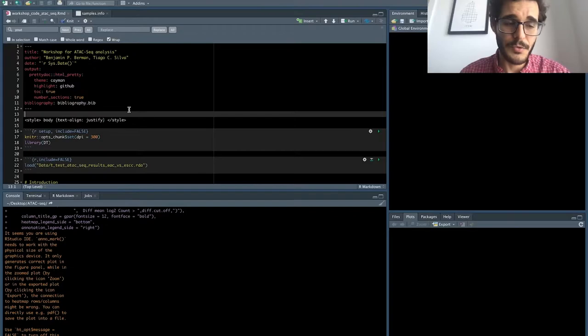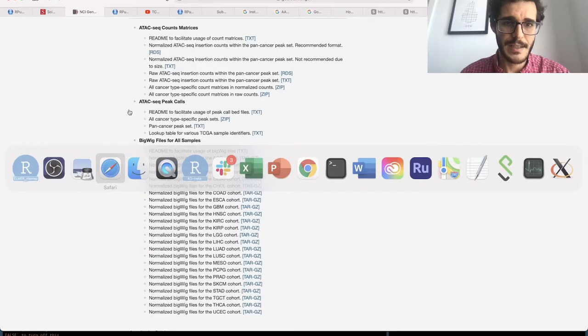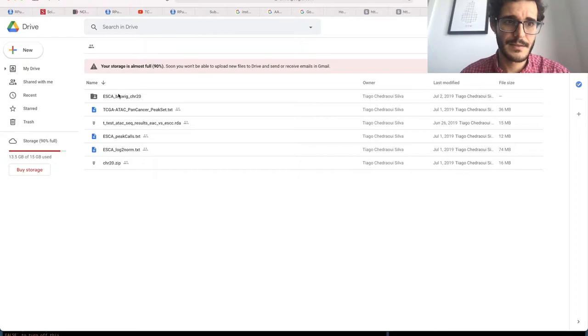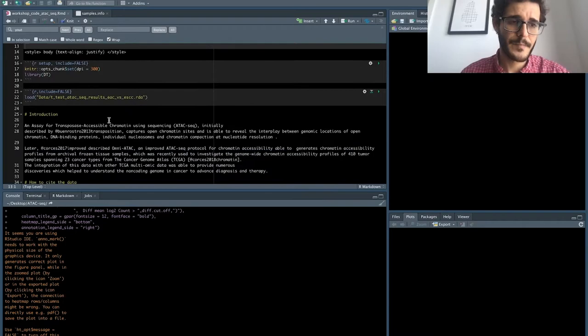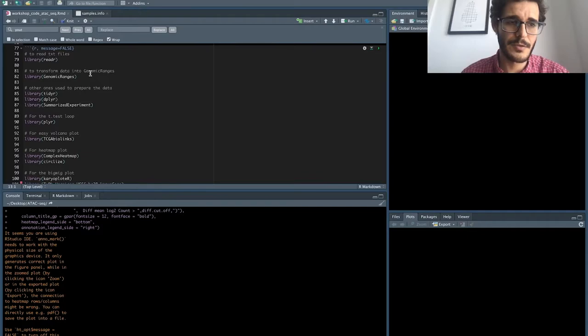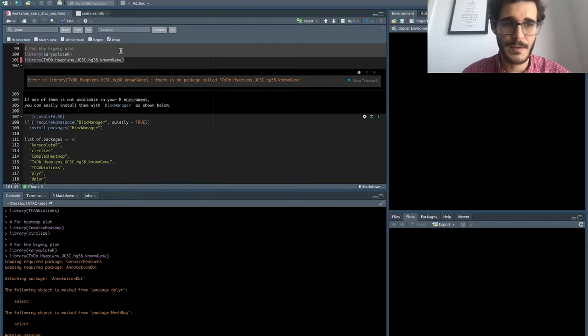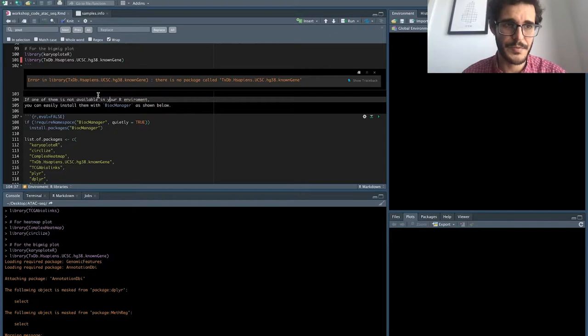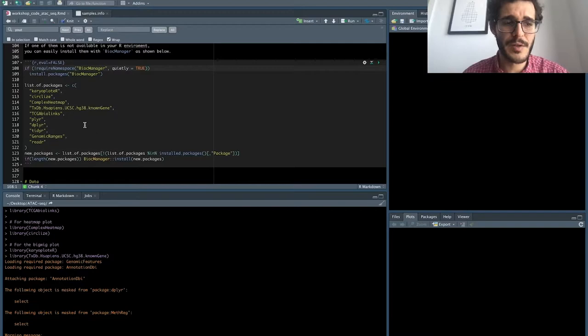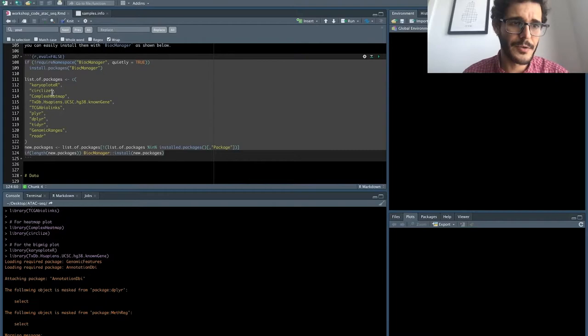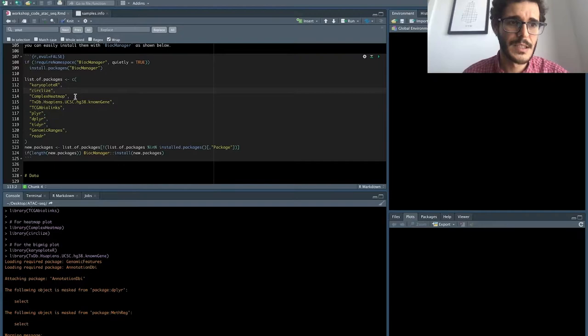If you go to the R Markdown file that's available within the Google Drive folder, you can download the data and have all the code you need. First, we start by loading the libraries. I'm using RStudio — here is the code and the bottom is a terminal where I can run an R session. There's also code where if you don't have the libraries, you can just run it and install the missing ones.